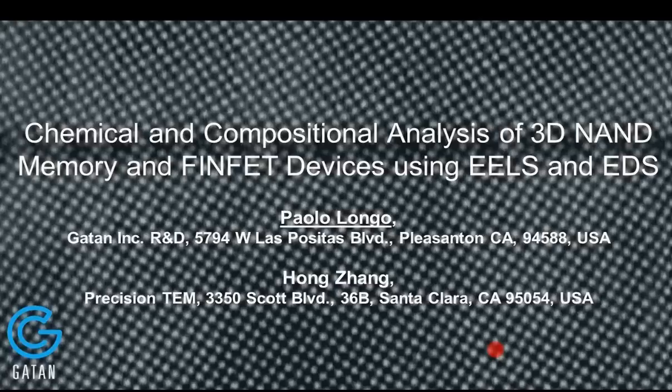This is actually what we try to address with this webinar. Watch for the effects of beam current, because I've seen many people running their microscope with a huge amount of current, 600, 700 picoamp. You basically end up destroying the sample. And this is actually a kind of delicate structure.